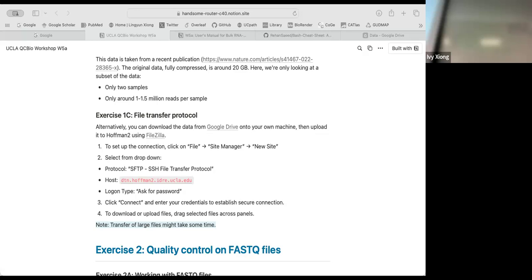Yeah, try something again. So we get it to work. So I have it downloaded and let's have a look.